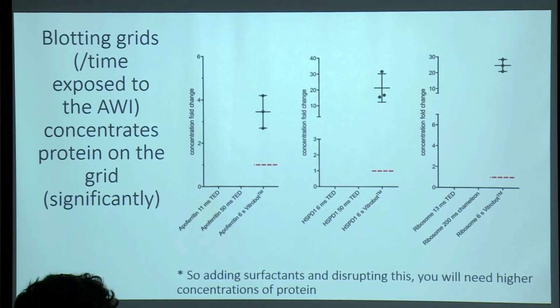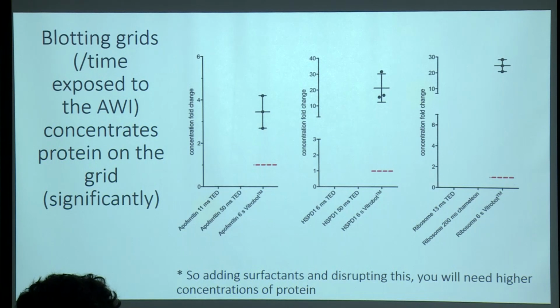Well, the first thing that was really noticeable is that, when we're working with our proteins of interest, our macromolecules, we can measure the concentration of our protein prior to it going onto a grid. And you can therefore theoretically calculate, if you know how thick your ice is, you should be able to predict how many particles we should see in the ice layer as we're going through our cryo-Electron microscopy experiment. So we should be able to know how many particles we would expect. And one of the really interesting things that we see is that the number of particles in the thin film environment often doesn't correlate very well with what we expect.